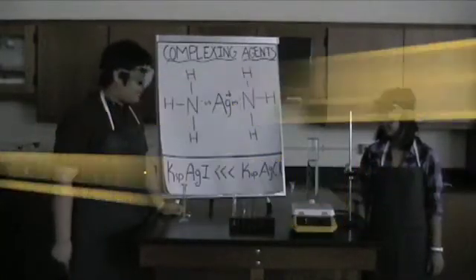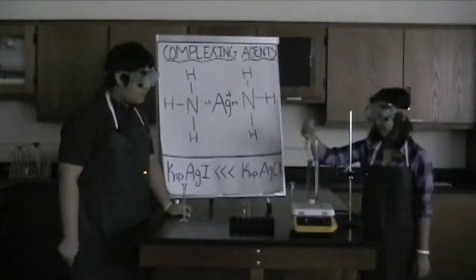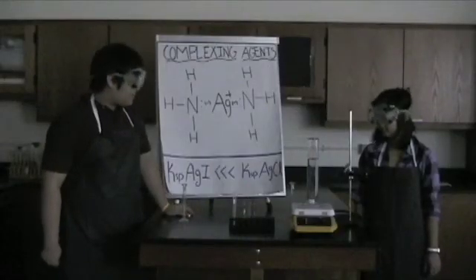Awesome. Let's precipitate out silver one more time. This is potassium iodide. So why is that precipitate being formed?